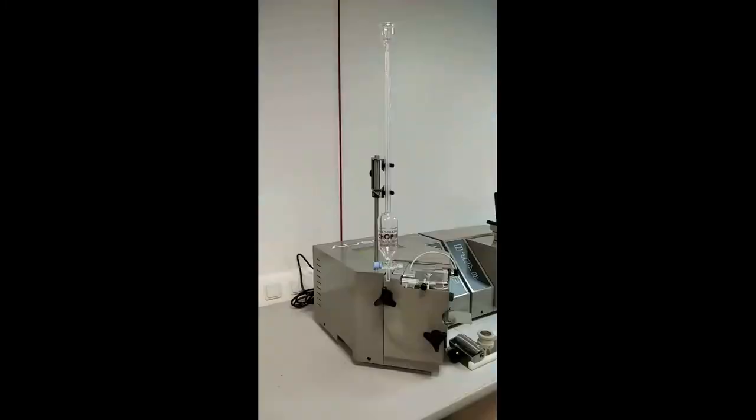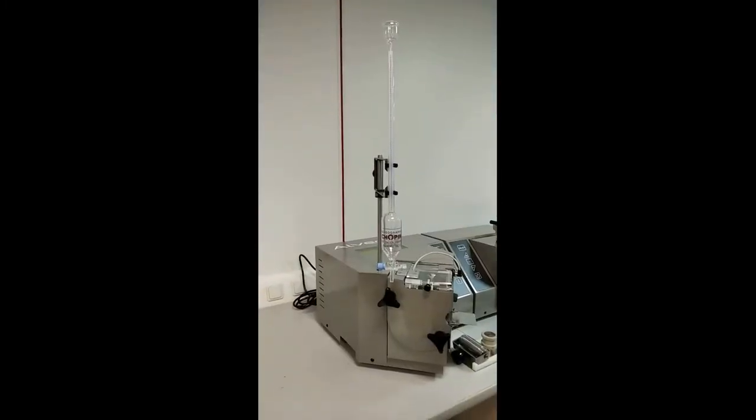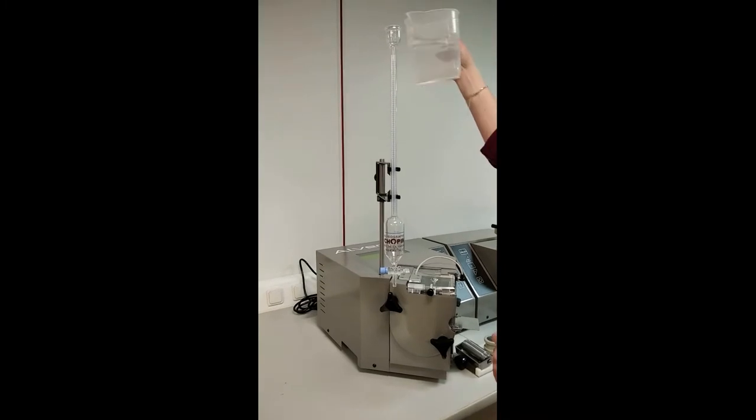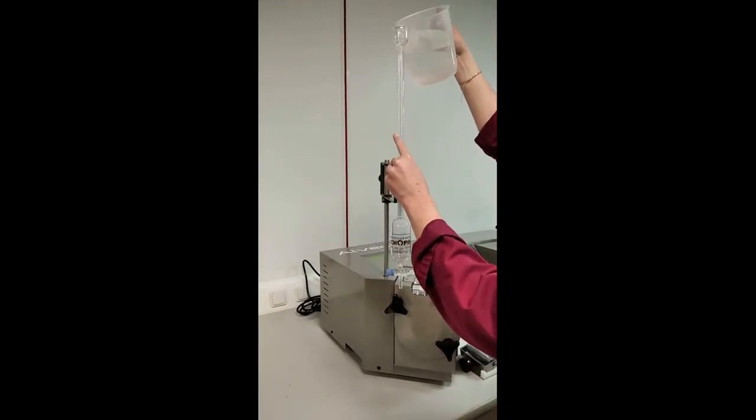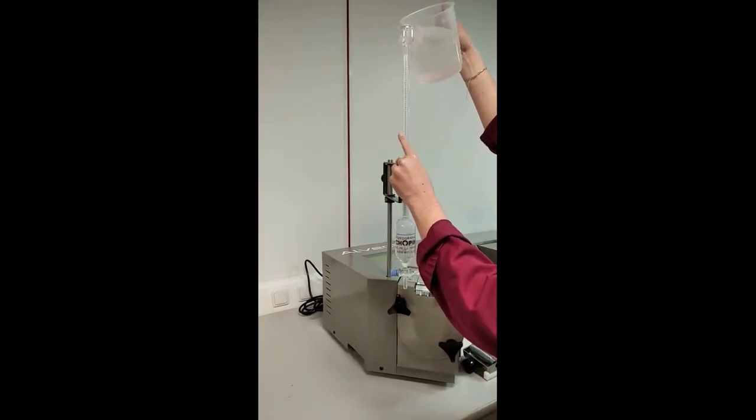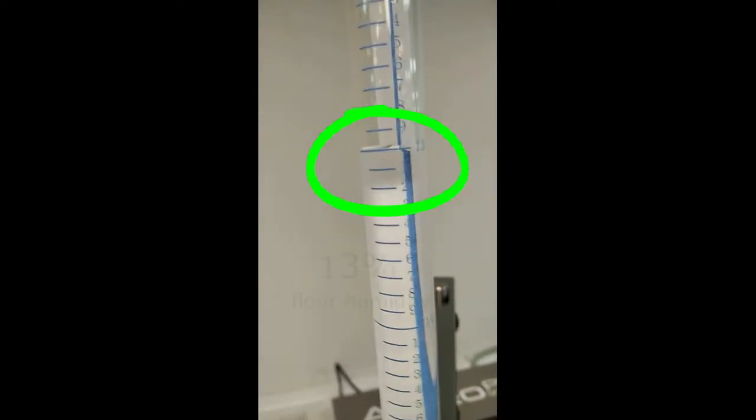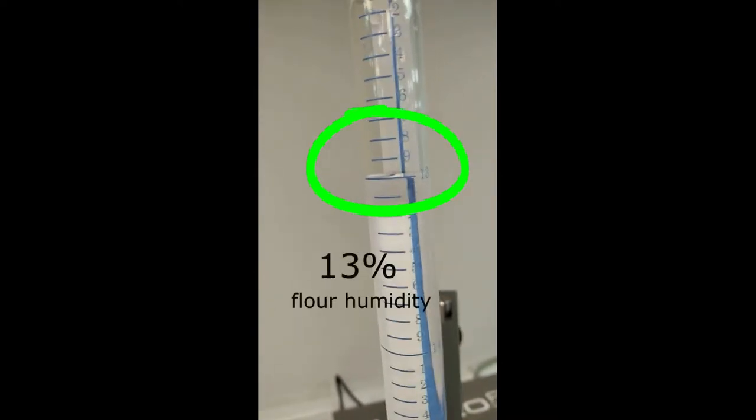Fill the burette to deliver the appropriate quantity of salted water at 2.5%. This quantity can be read on the burette as the water content of the flour.